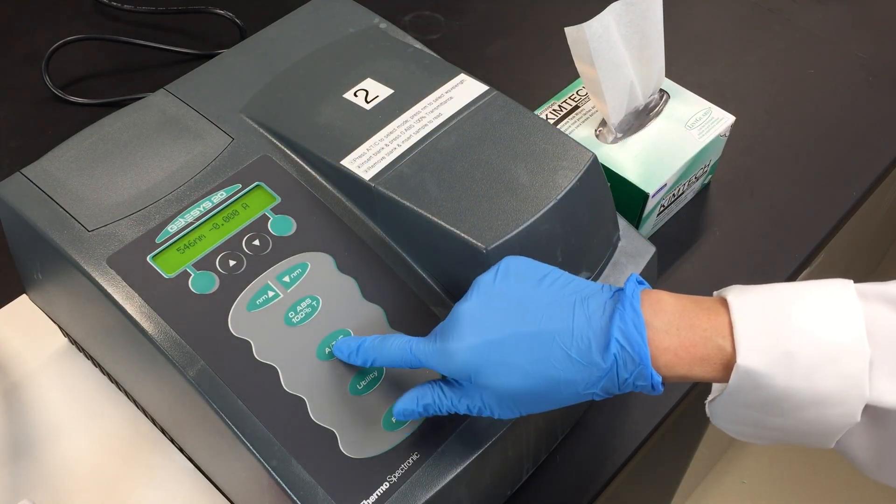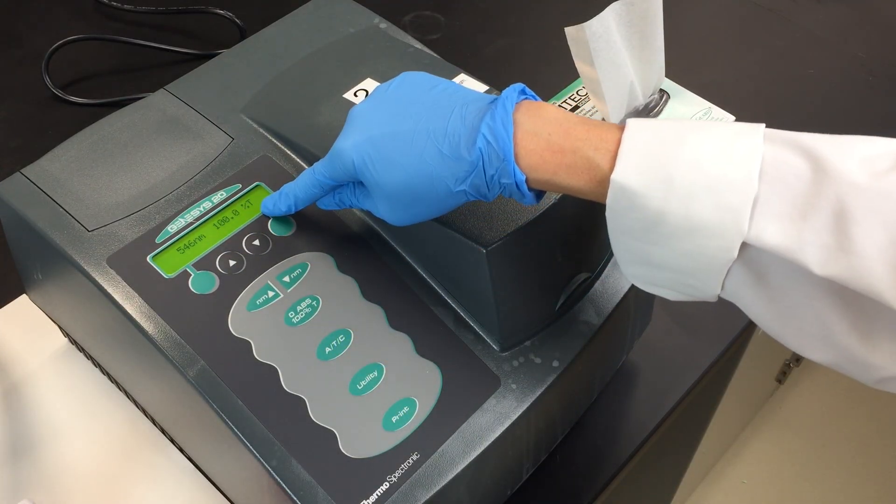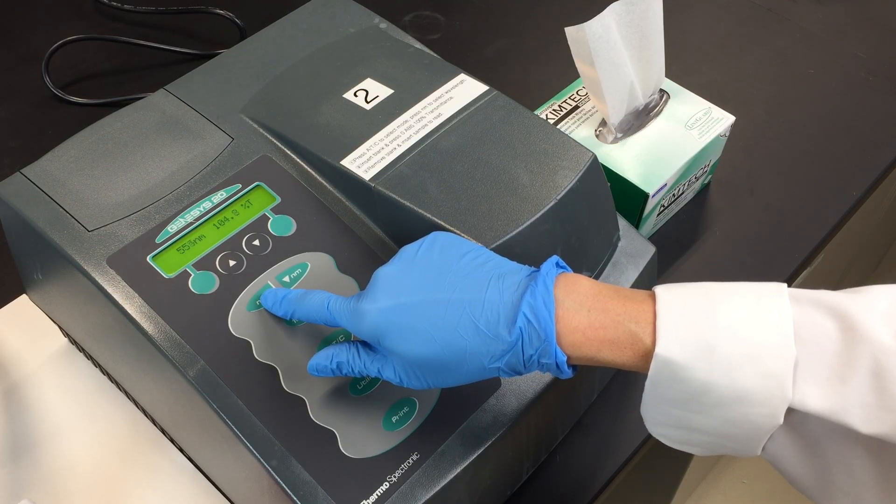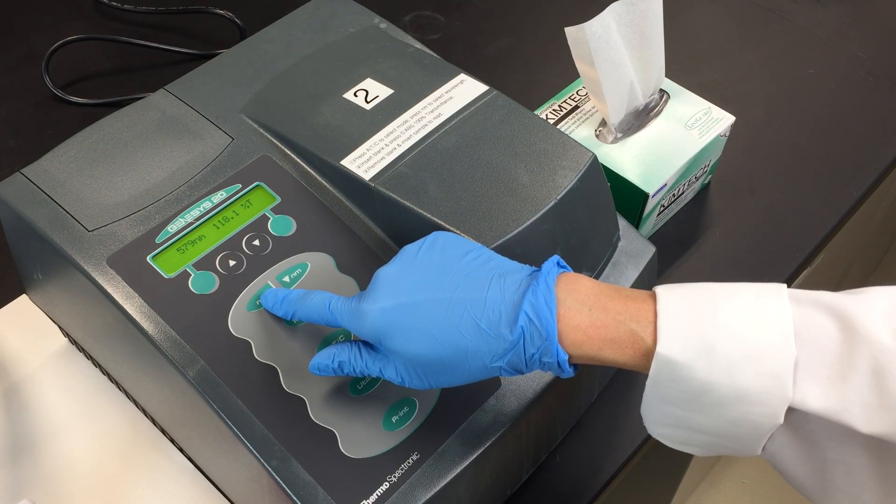Press the ATC button to change to percent transmittance and press the nanometer up and down buttons to set the wavelength to 625 nanometers.